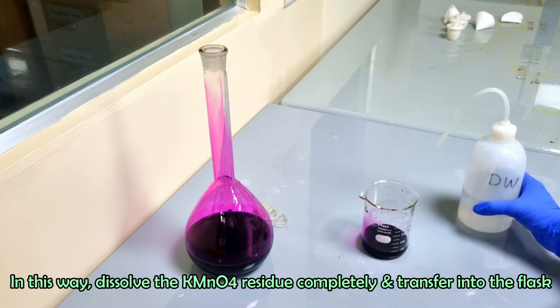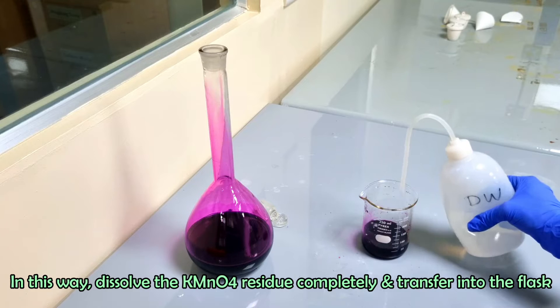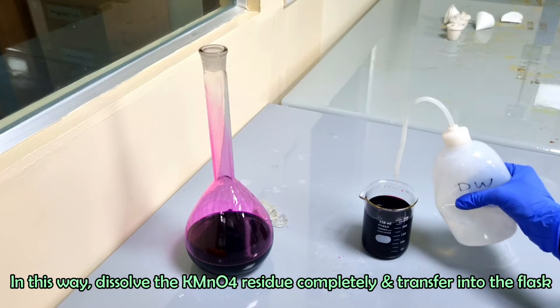In this way, dissolve the residue of potassium permanganate completely and transfer into the volumetric flask.